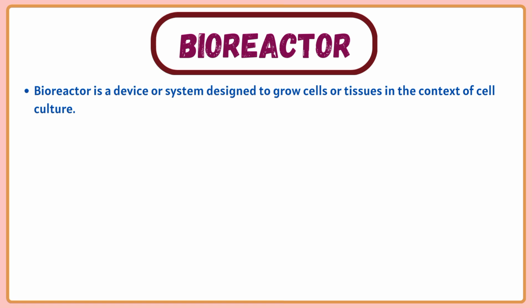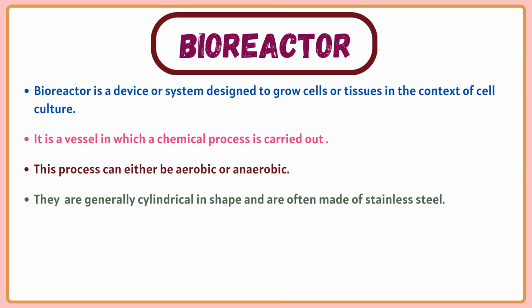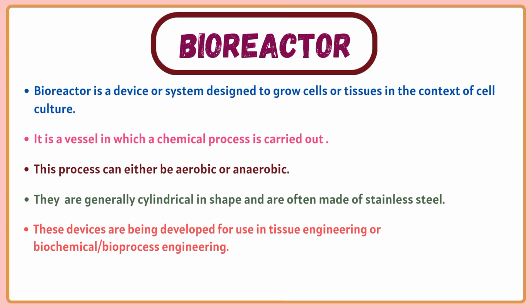A bioreactor is a vessel in which a chemical process is carried out. This process can either be aerobic or anaerobic, and bioreactors are generally cylindrical in shape and are often made of stainless steel. These devices are being developed for use in tissue engineering or biochemical or bioprocess engineering.